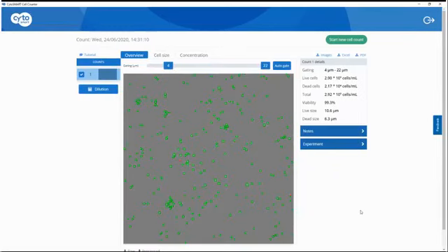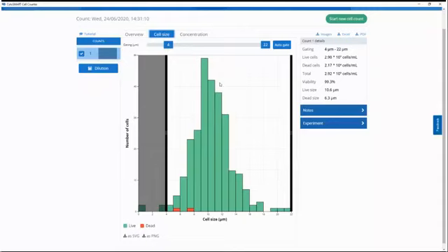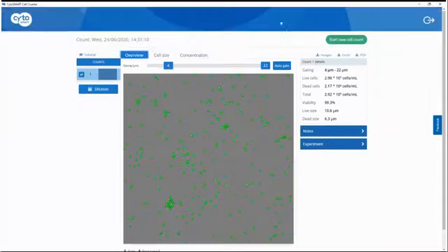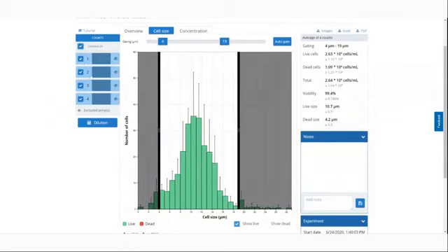All right, and again, if you look down in the lower left quadrant, you can see there are some cells that are in a cluster, and this declustered them very well. That was one of our recent improvements. And again, we can gate. So let me show you back in the cloud now. We can also turn off our lives and deads. That's particularly useful when you have a higher percentage of dead cells. So I will send it back to Alex now.